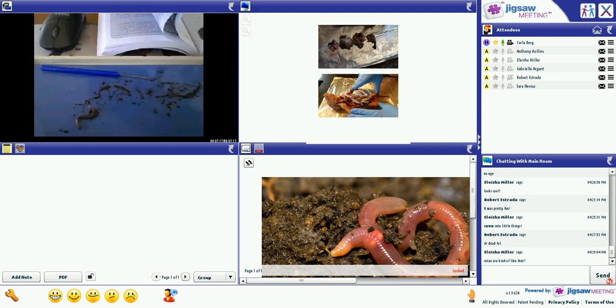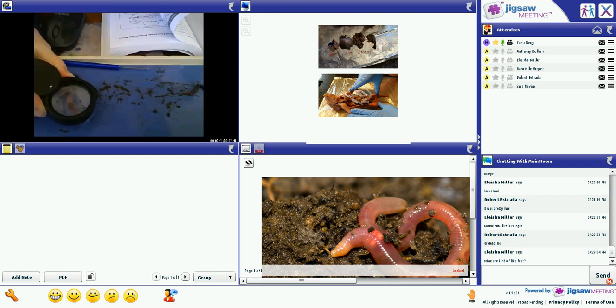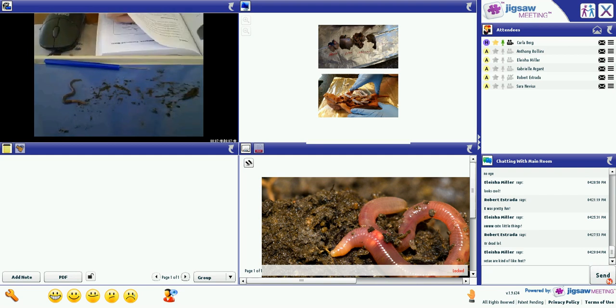The prostomium, you're also not going to be able to see through my camera lens, but if you have a magnifying glass and you hold it up toward the head end, you may be able to see the prostomium, and it basically is his mouth. I can see it a little, but I'm sure you guys can't see it through the camera. And the very last thing to label is the anus, and the anus is at the worm's back side.